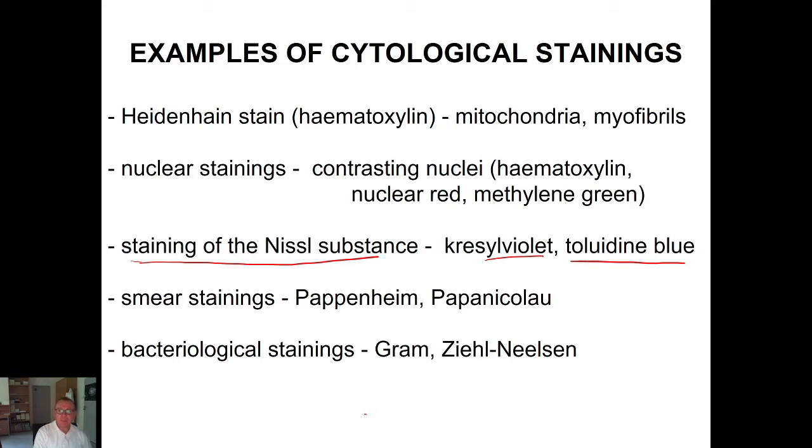And yes, we have got also slides of blood, so-called blood smear and bone marrow smear. So smear stainings are used there, and it is Pappenheim's method. I will speak, or somebody who will have the lecture about the blood will speak about it later.